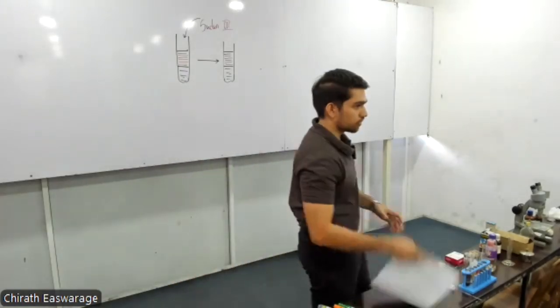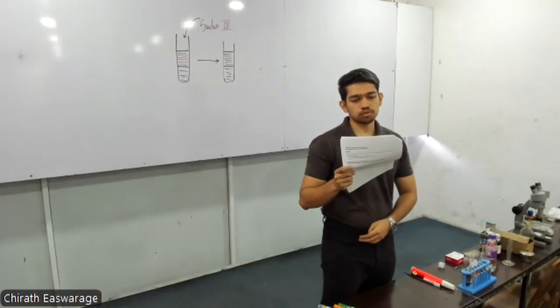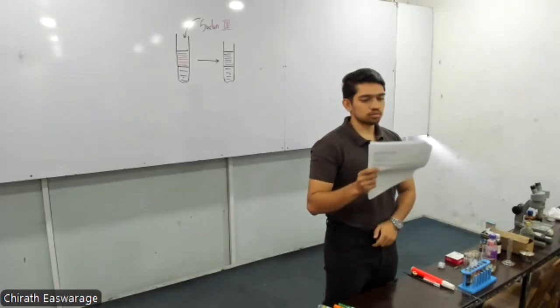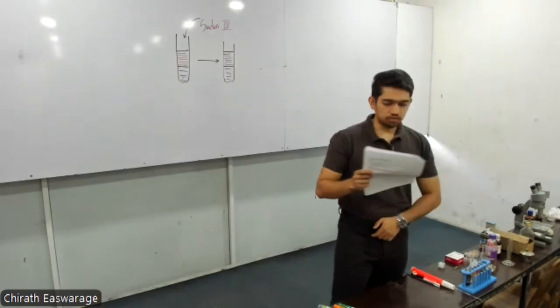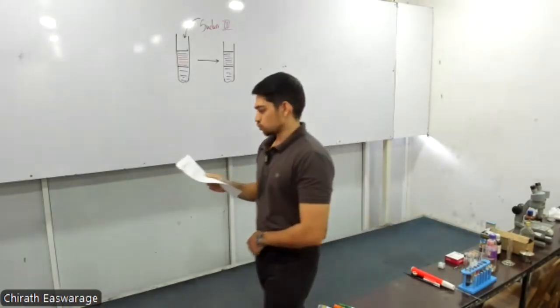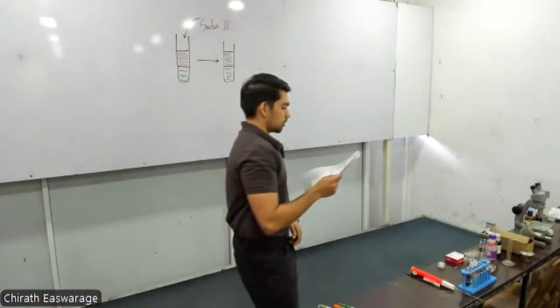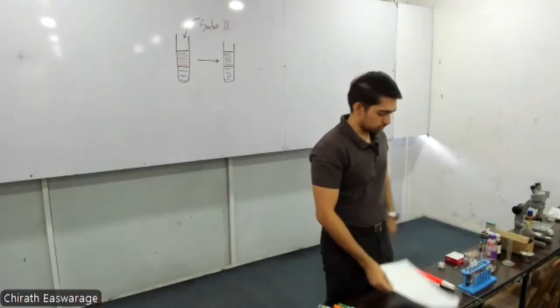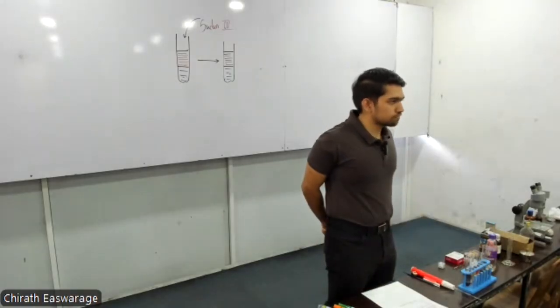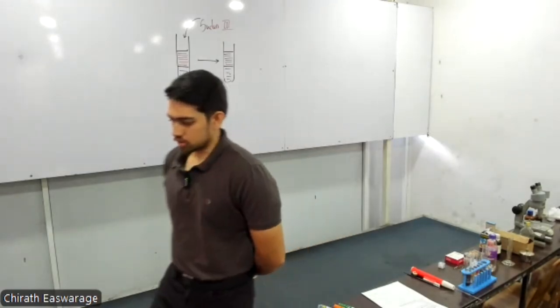So, moving on to the second session, part of our practical seminar. Practical number 6: identification of parts and functions of the light microscope and use of the light microscope to observe specimens. Then, all light microscopes have 3 basic components. What are the 3 basic components? All light microscopes have 3 basic components.